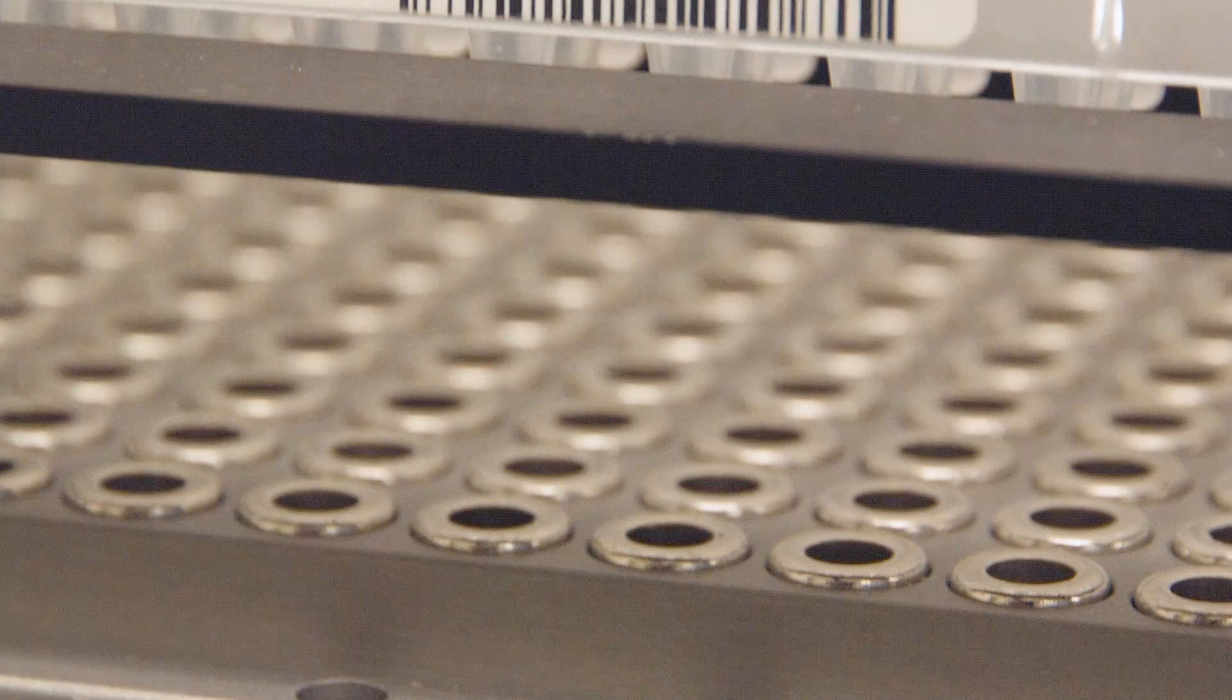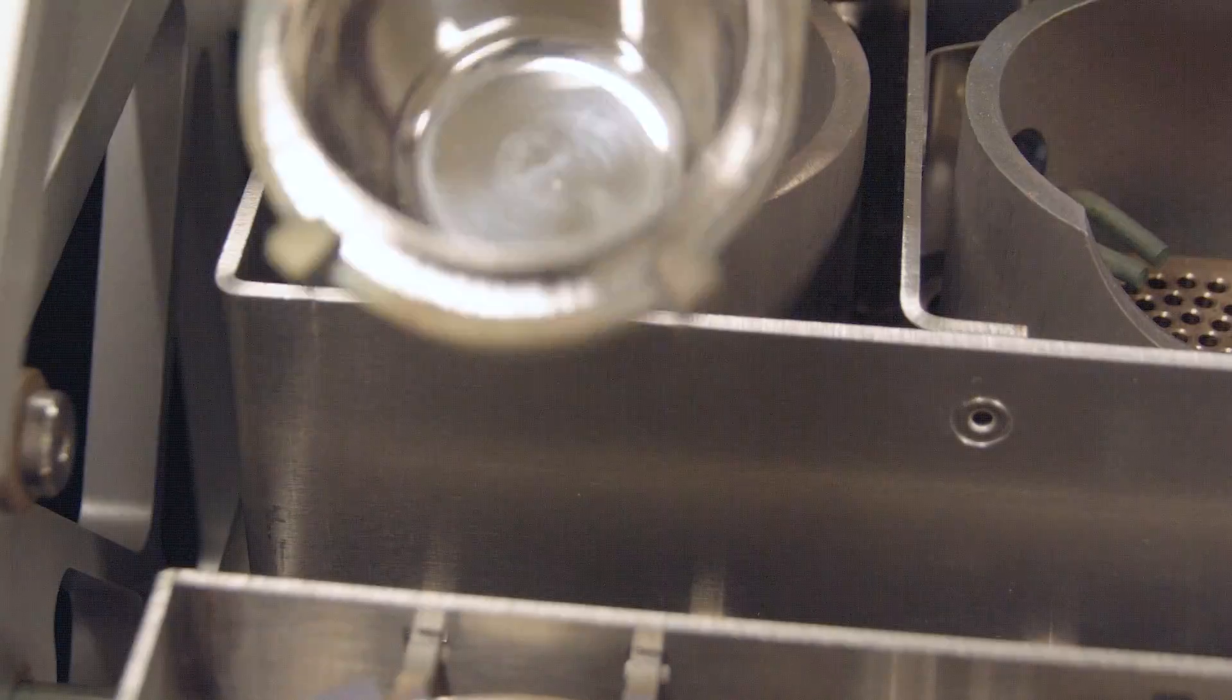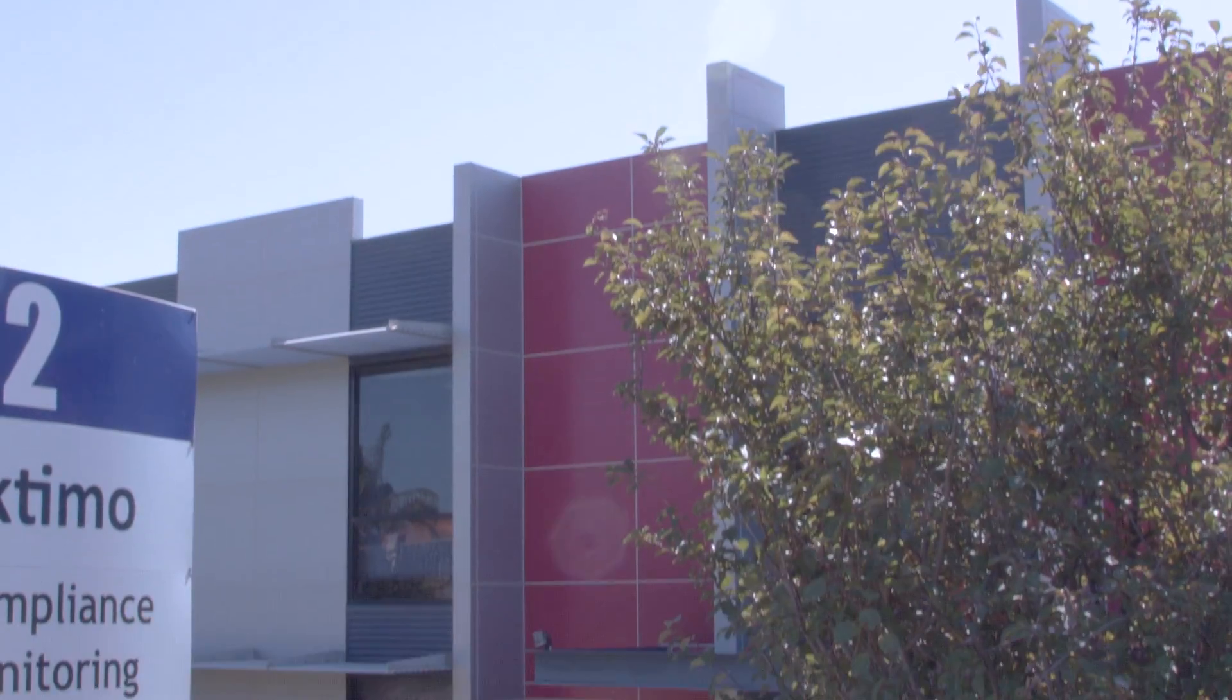Providing analysis instruments and equipment to the civil, industrial and mining sectors. Laboratory Analysers Australia.